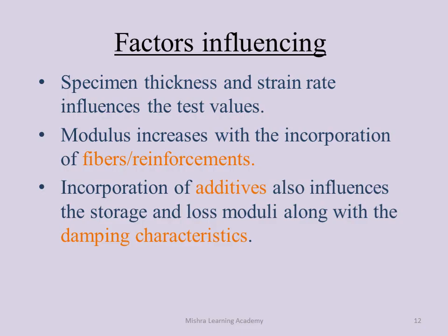Factors influencing: specimen thickness and strain rate influence the test values. Modulus increases with the incorporation of fibers or reinforcements. Incorporation of additives also influences storage and loss moduli along with the damping characteristic.